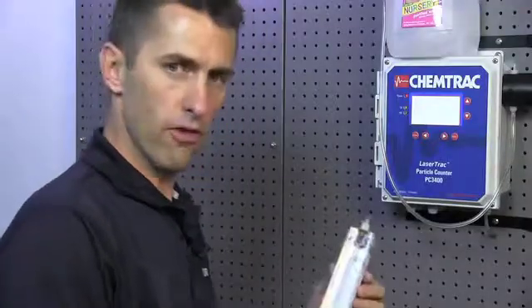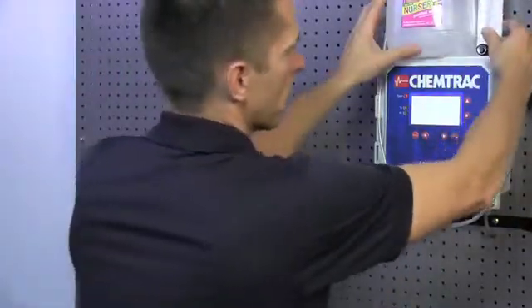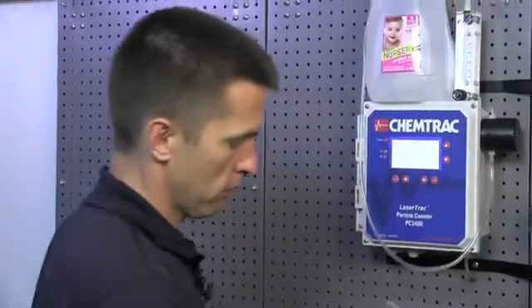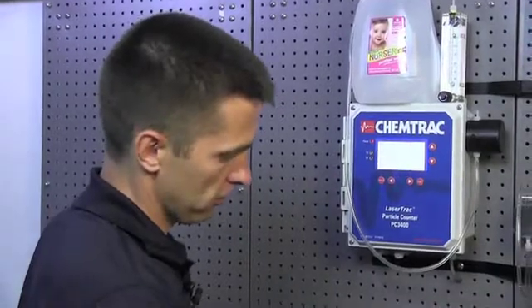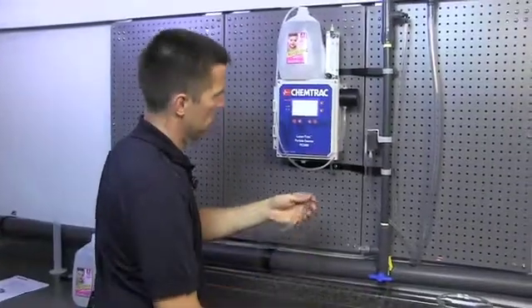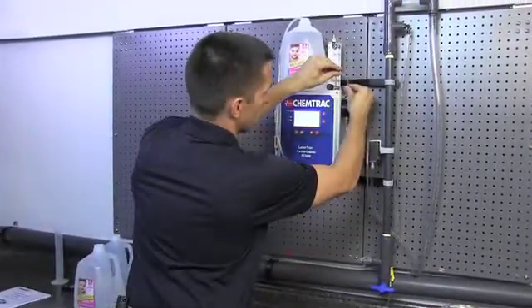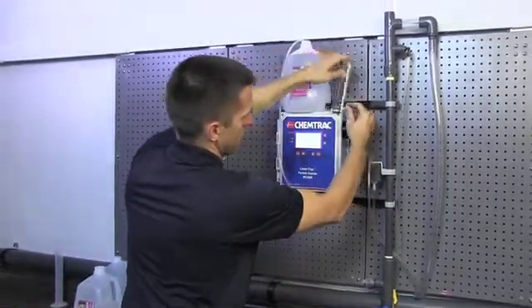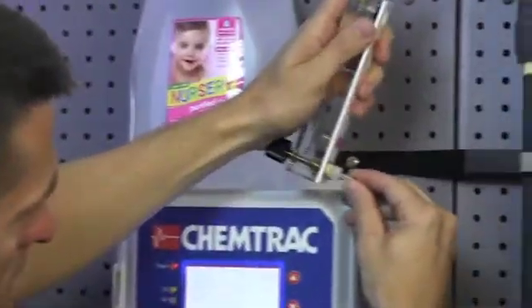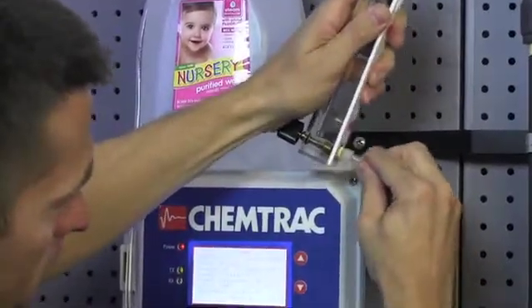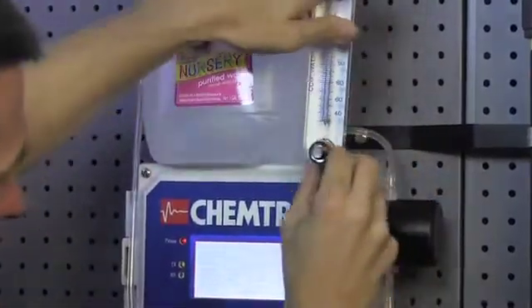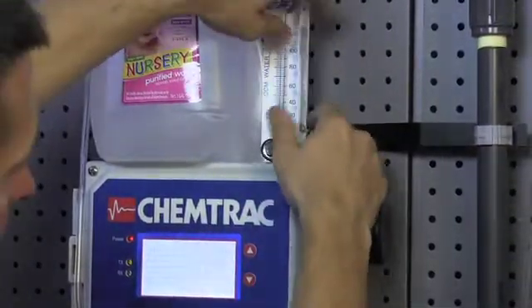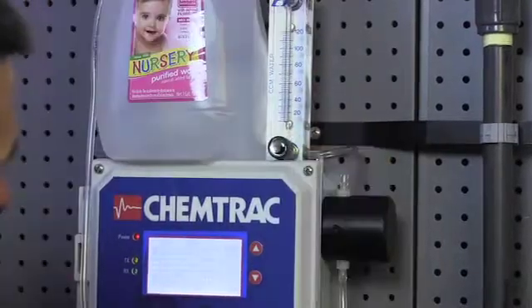Next we're going to take the flow meter and we're going to attach it to the top of the sensor. You're going to simply place it up here for now. Cut a relatively short piece of tubing, maybe only just five or six inches. Attach one side to the top of the sensor. We're attaching the other end to the bottom of the flow meter, the inlet side. If you have a flow meter with one of these needle valves on it, just make sure that it's all the way open. Then let the flow meter sit there on top of the unit.